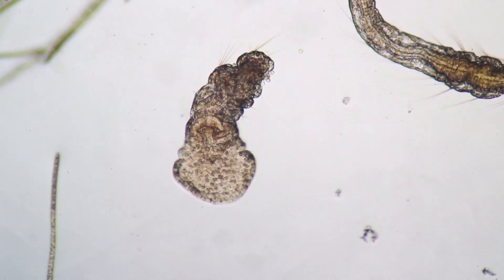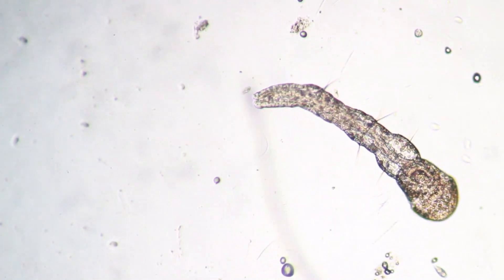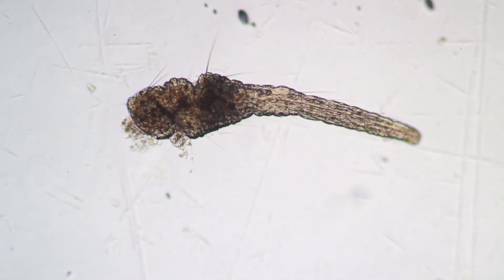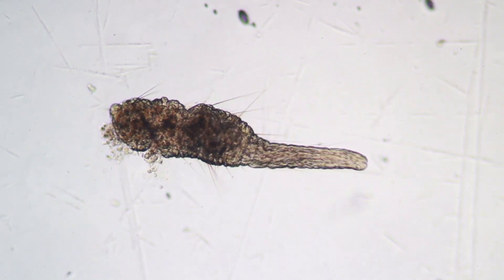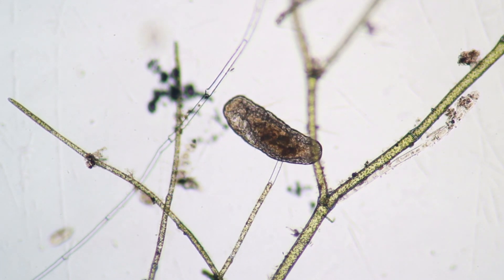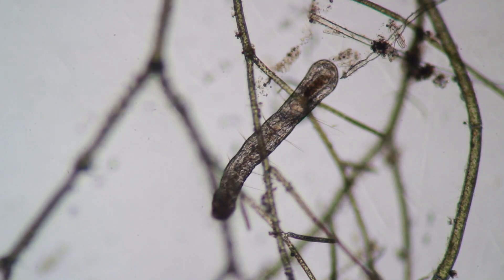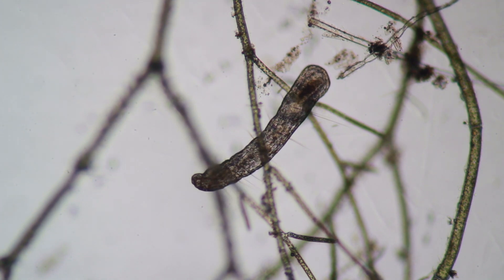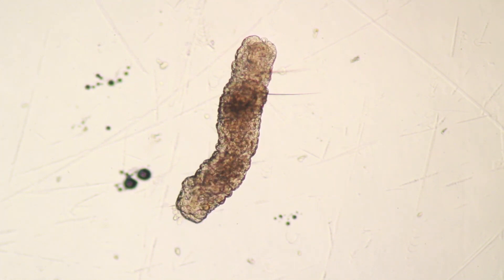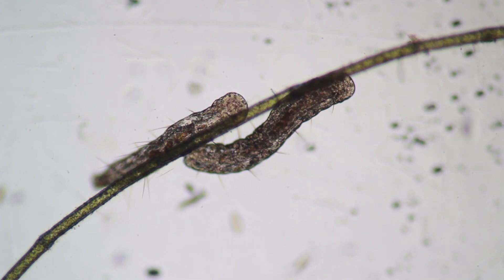You can see a complete worm next to the head, which shows the size relationship. A little bit of time-lapse just to see the movement. Several days later you can see it's now significantly larger because the rest of the body started to grow as well. And there's still the stump that was cut off, still trying to move — it's a little bit like a zombie: it doesn't have a head anymore but still continues to live. As I mentioned, they did not really develop any further because without a head they're not able to take up any food.